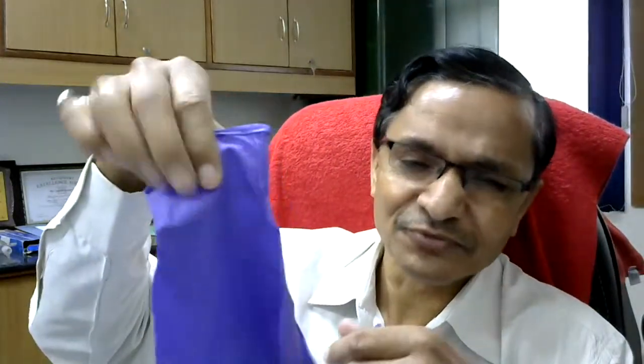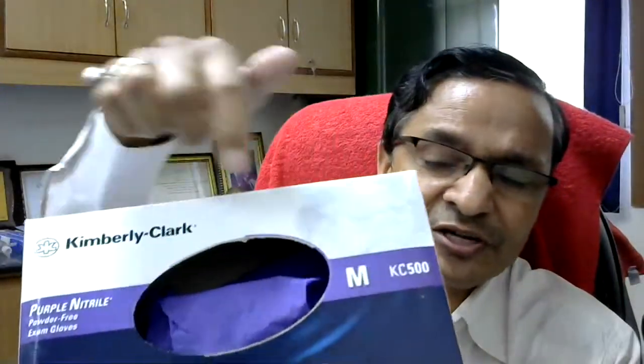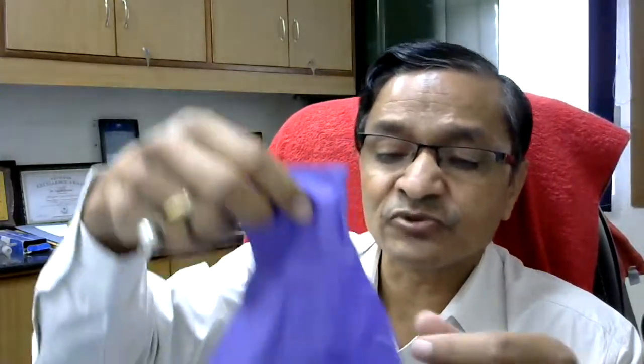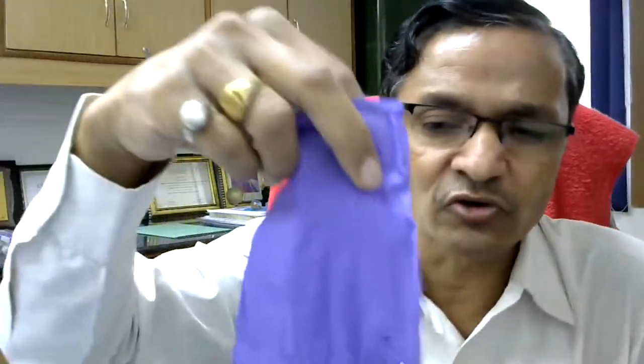For me, medium size gloves are fitting, so I am going to use these gloves. You can see these are the gloves put in the box, medium size is written. So accordingly you have to select the gloves and then use them. If I use small size gloves, they will not fit. If I use large size gloves, they will be too loose in my hand, and it will be difficult for me to work wearing that sort of gloves.